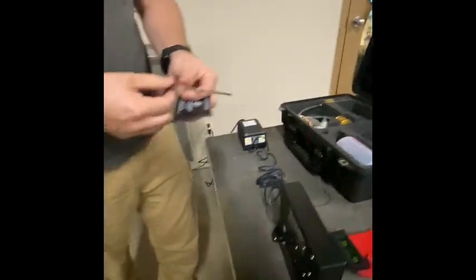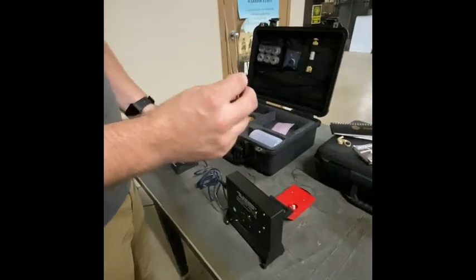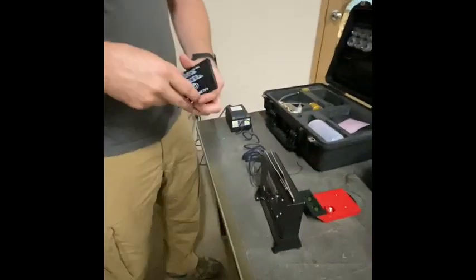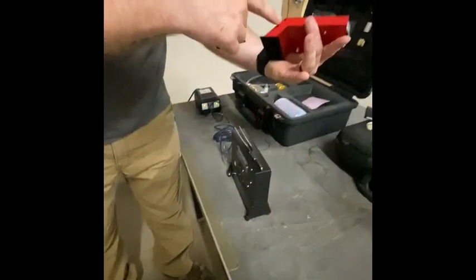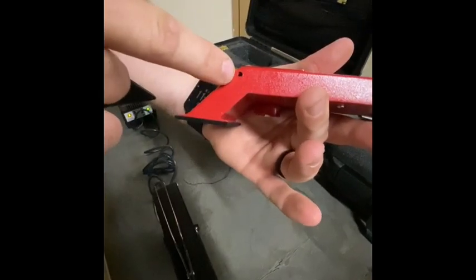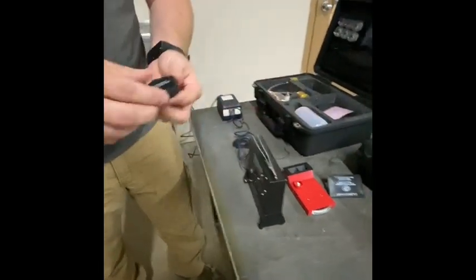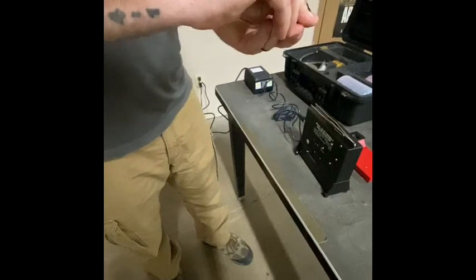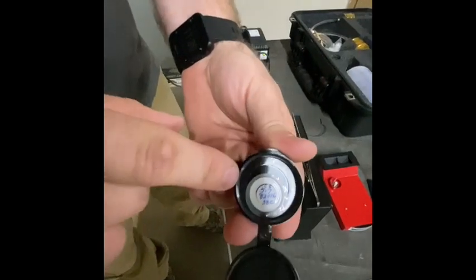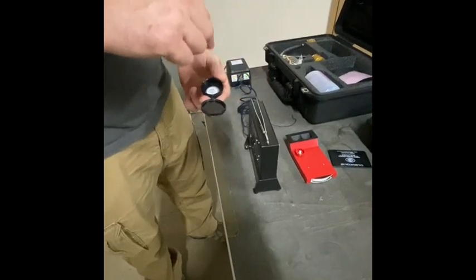So these are the tweezers that are in every kit. You will use these in every process that you do with this testing kit. Screwdrivers for calibrating this machine itself. That little hole, you use the screwdriver to calibrate this to make sure it's correct. And here's your calibration pad. So this calibration pad has a number on it, the 5.7. So the 5.7 is the number that you will always calibrate this machine off of.